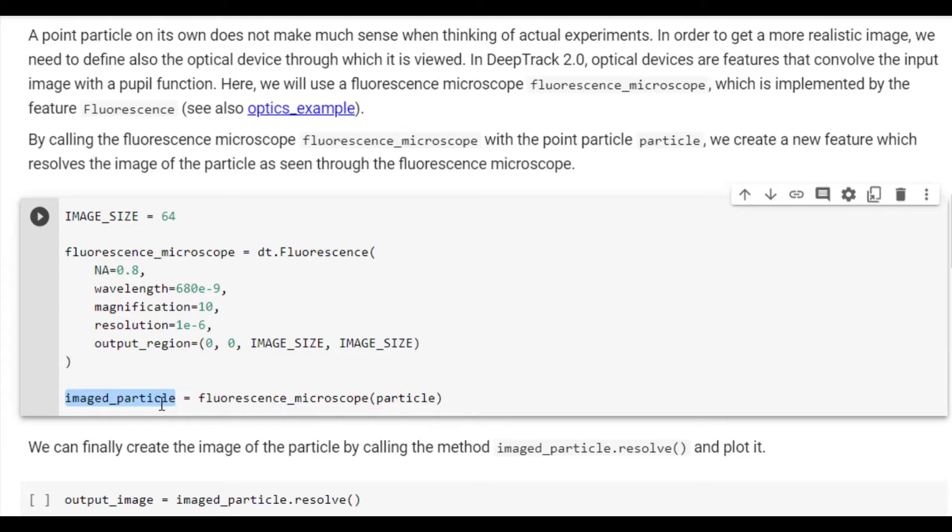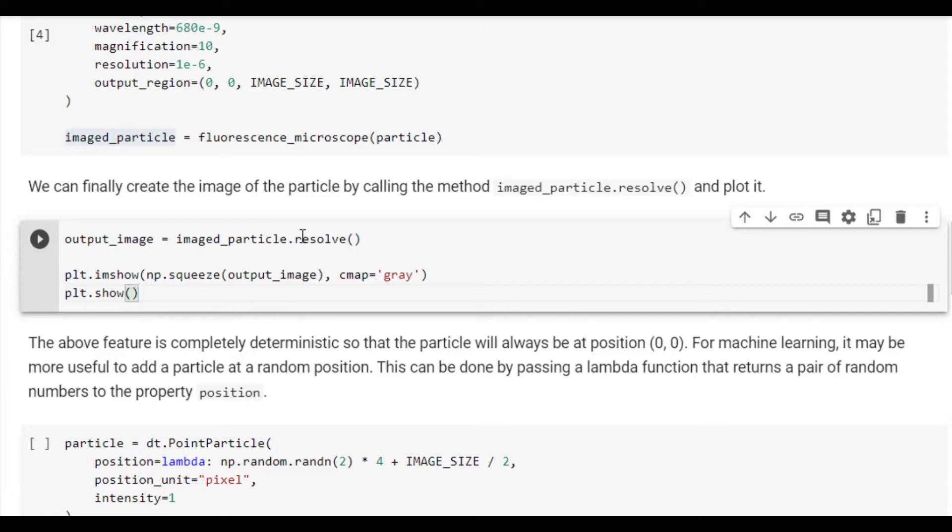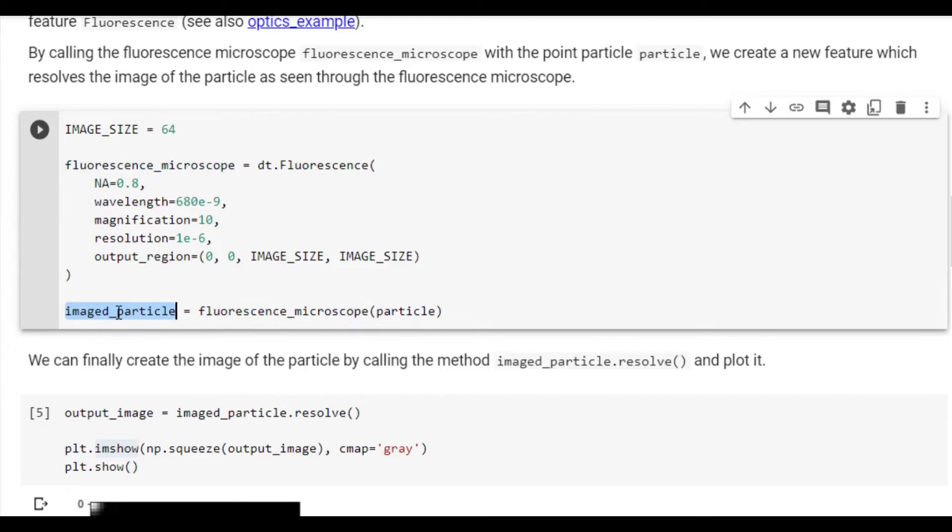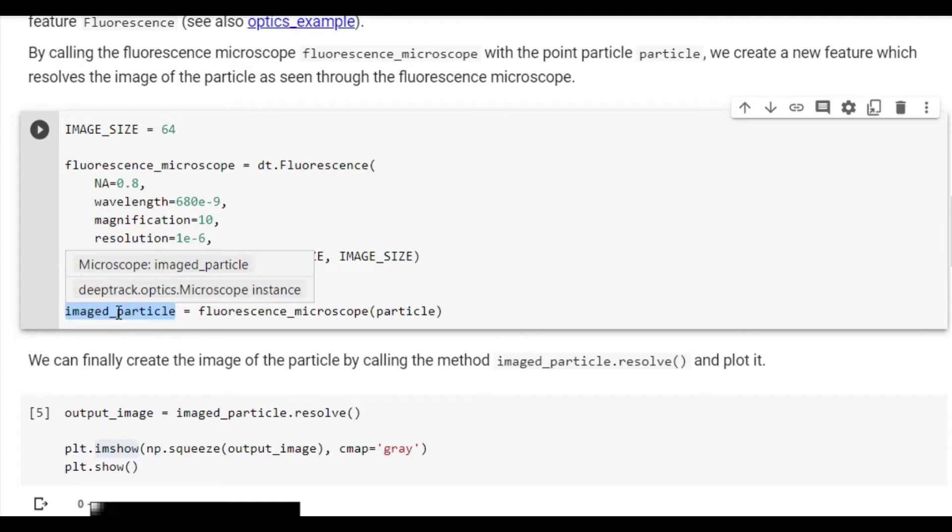To actually create the image, we need to call .resolve. We also show this image using Matplotlib. You can now see the particle as a bright spot in the top left corner. What we have created so far are three objects: the particle, the microscope, and their combination. These are examples of what we in DeepTrack call features. And since they are so important to working with DeepTrack, we'll explain them in a little bit more detail in another example.